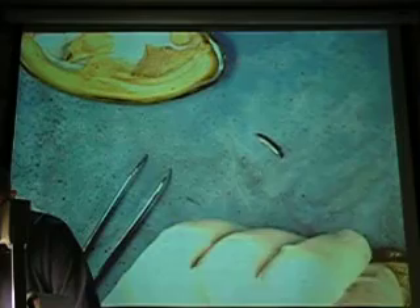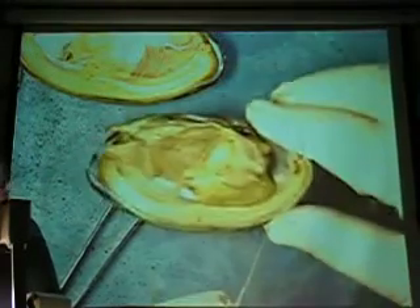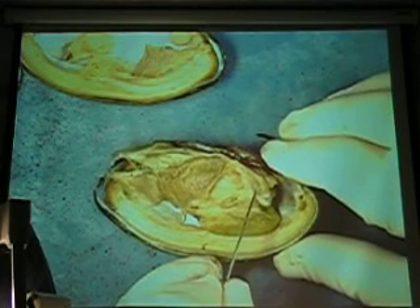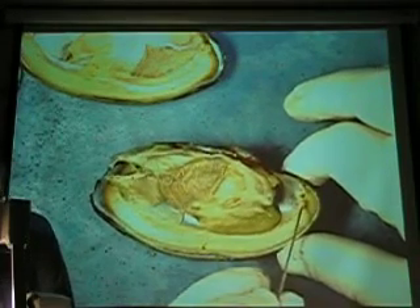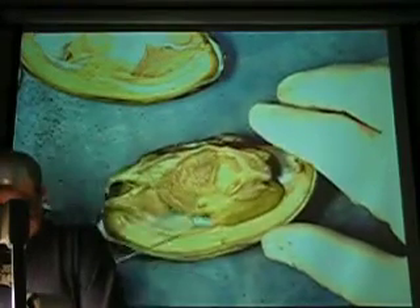What am I looking for? What's next? There's a muscle right here — there's a muscle right there. You know what that is? Anterior foot retractor. Foot retractor. And so that makes this the anterior adductor. That was the one I had to cut through to get the shell open.